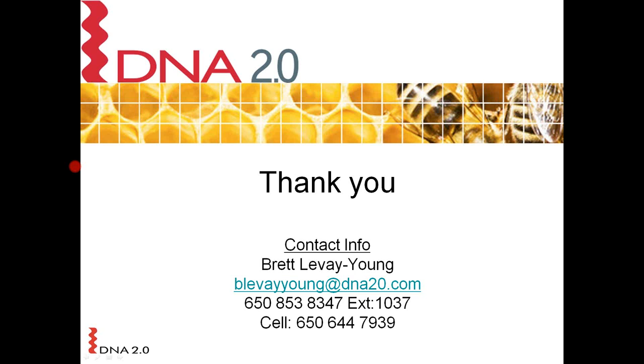And we are right now, in fact, developing new tools to automate many of these steps so that neither you nor we will make mistakes. One of the things that we're trying to do with our new tools is develop reports that will meaningfully report to you the diversity that's been specified, how it's going to be encoded, and what that library is going to look like. Because our production systems are focused on producing individual sequence-verified fixed genes.